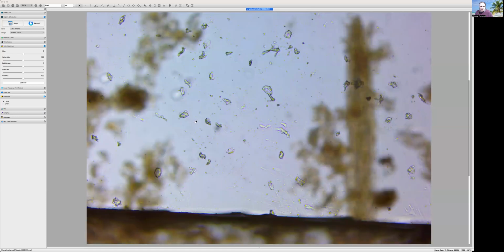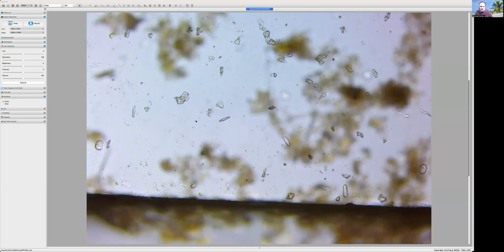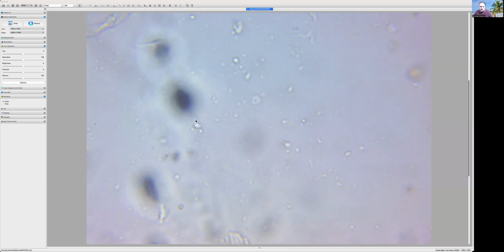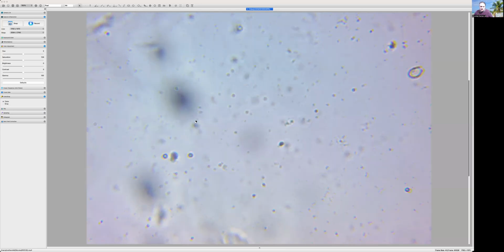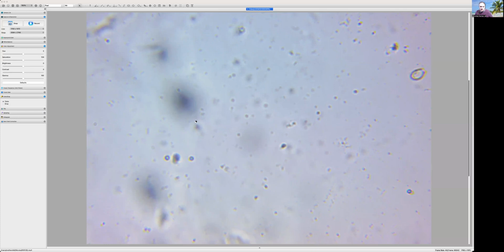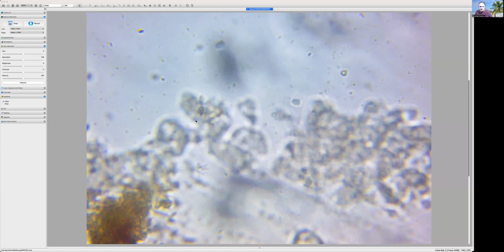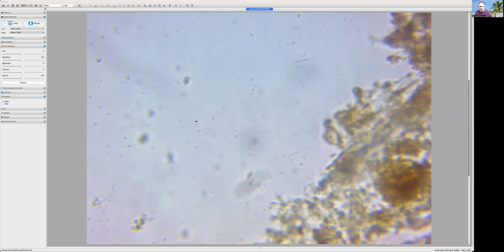In and out down here. Oh, come on. Darn it. There it is. Okay. That one there looks like a bumbler. Okay, we're getting out of the view of the slide here. Let's get down into the slide and see if we can find that. Should be somewhere right here at the edge. I know I said we were going to be done and then we find something there.